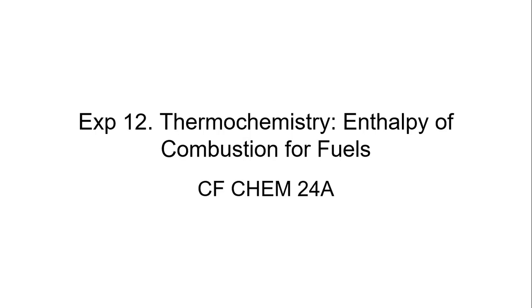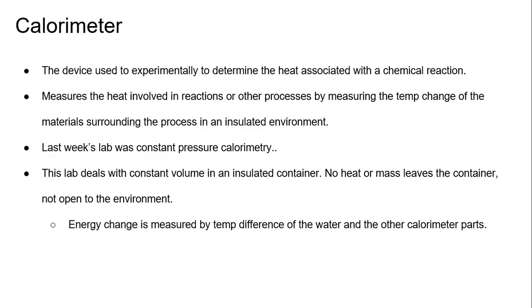Hi class, this week's lab has to do with more thermochemistry. This is the enthalpy of combustion for fuels. The calorimeter, last week you would have used a styrofoam cup for a calorimeter.